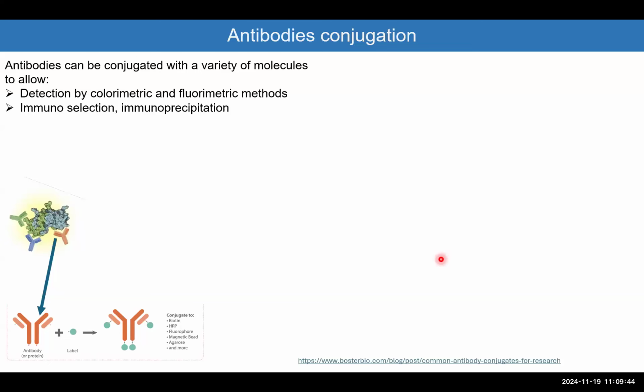Nowadays, all these antibodies are available and we use them in research. So in principle, as for now, you can easily understand that when we generate antibodies, they are specific toward an epitope in a protein. So how can I use this? This is the next step in the application process. How do we use antibodies? And how can I detect antibodies?